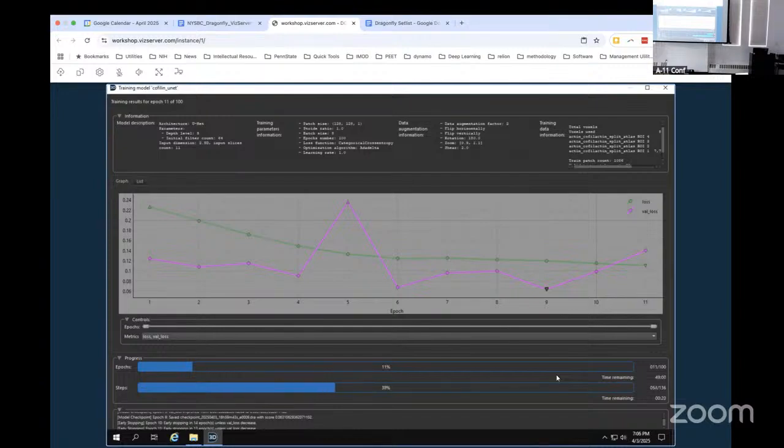Yeah, it does need that. If you unselect that, then you take it. I did do that. Do you want to see something? Sure.